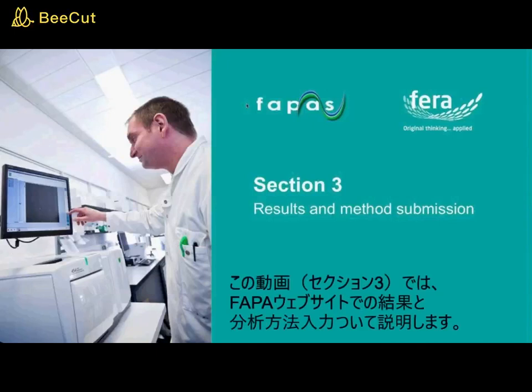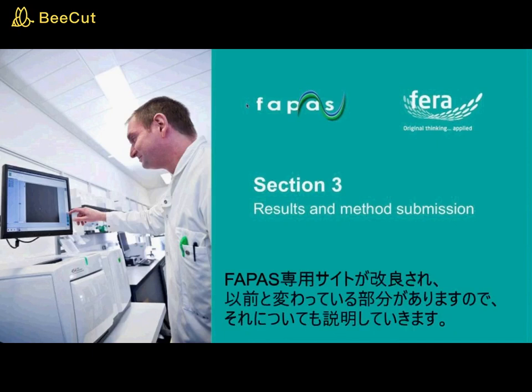Section 3. Results and method submission. So this is about how participants can enter results and their methods and the changes and improvements we've recently made to Fapas website reporting.